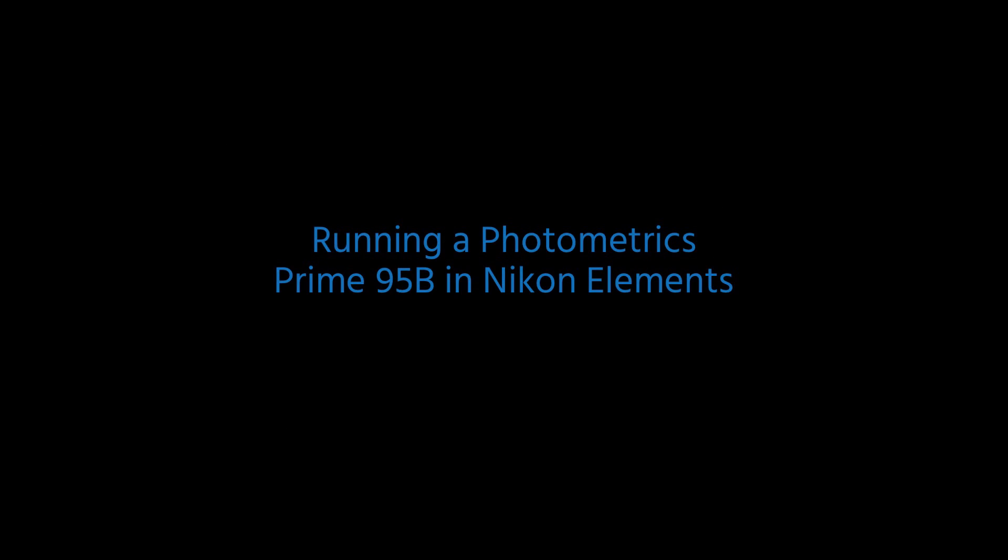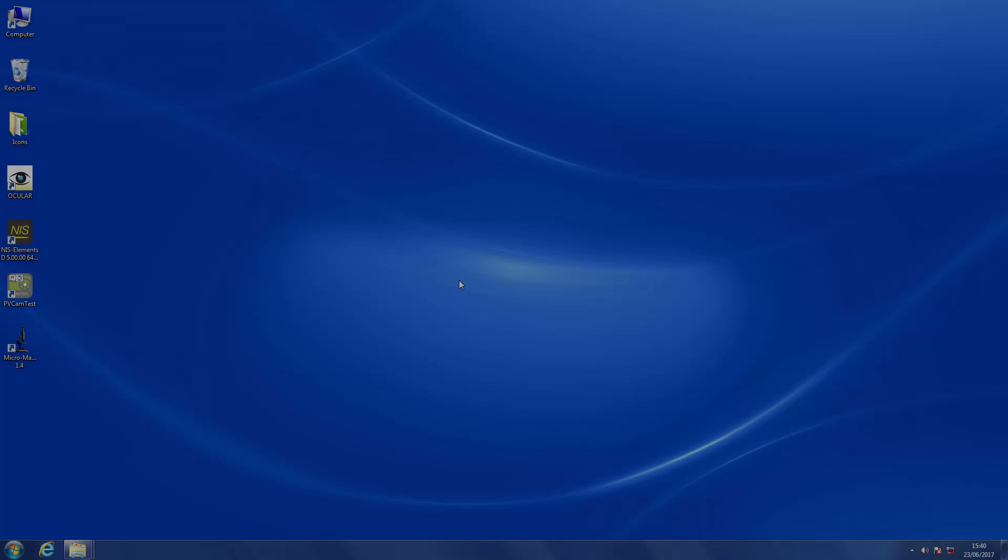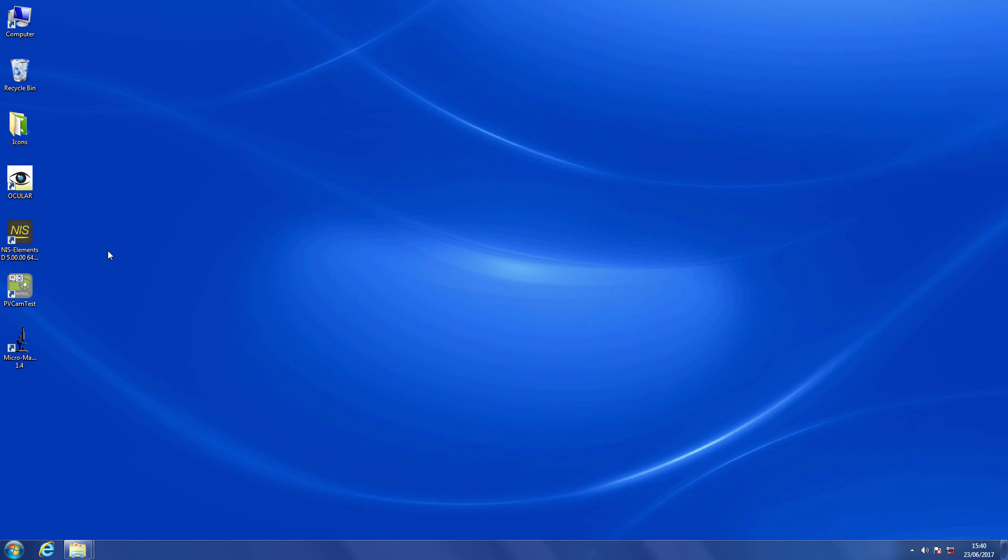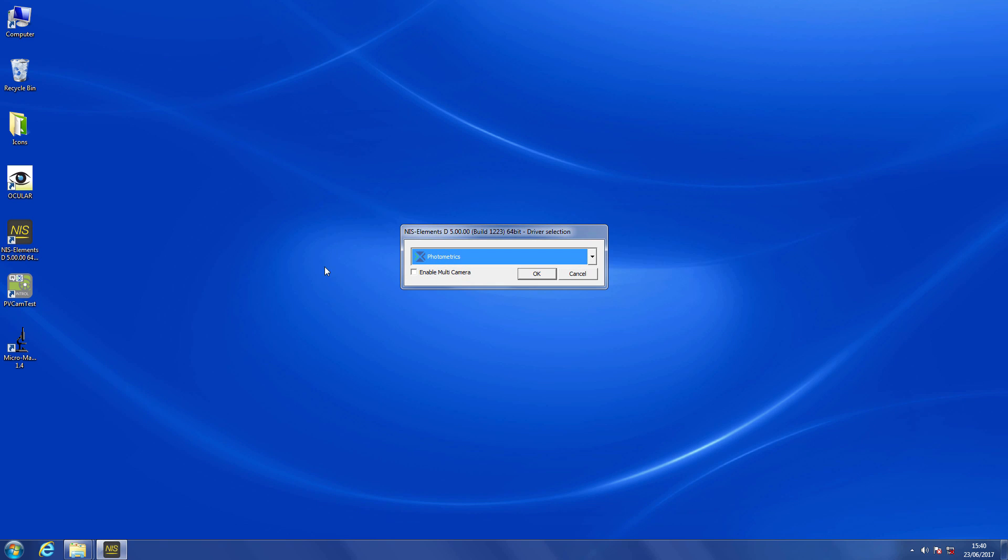In this video, we're going to look at running a Photometrics Prime 95B inside Nikon Elements. We're going to load up Elements to start with. Here we're using version 5. We're going to load up the Photometrics drivers.